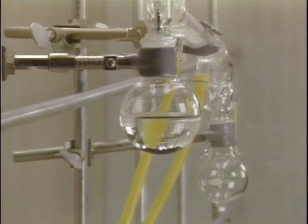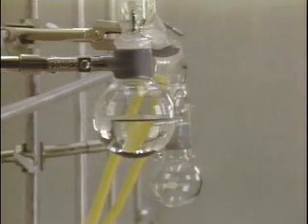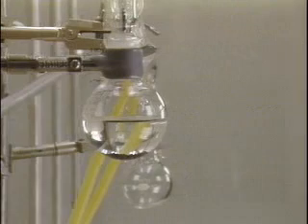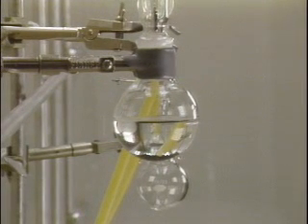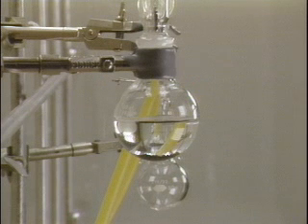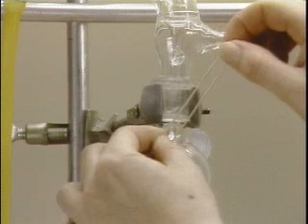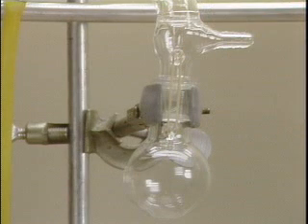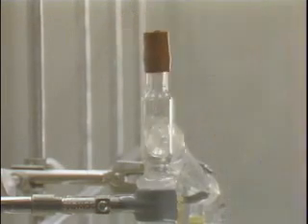To align the apparatus, first view the setup end-on to make sure that all the equipment is in a vertical plane. Straighten any twists. Then carefully tighten the clamps a little at a time in succession. Some small pieces of glassware, such as this collection vessel, have hooks and can be attached to the adapter by rubber bands or springs.